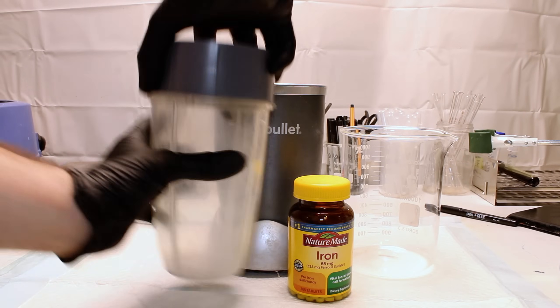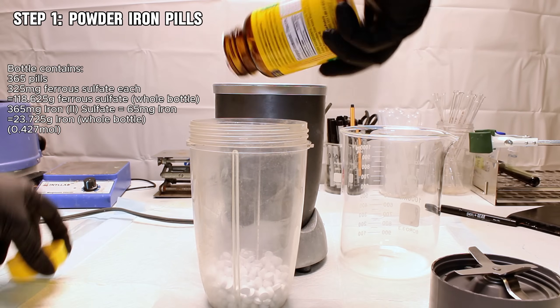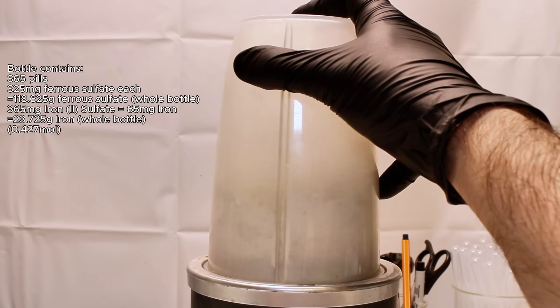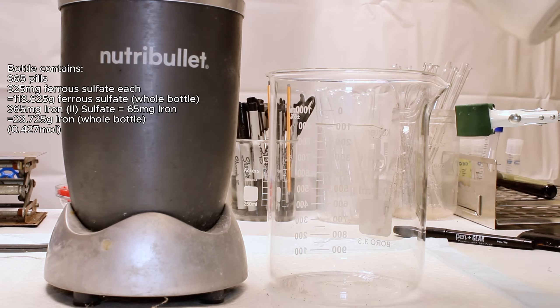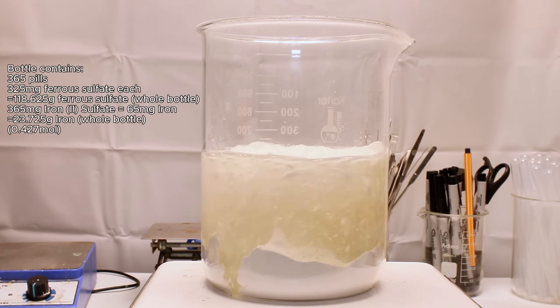To get started I went ahead and powdered the pills in a blender. This bottle contains 365 pills that allegedly contain 325 milligrams of ferrous sulfate, equating to 65 milligrams of pure iron. This is 118.625 grams of ferrous sulfate, or 23.725 grams of pure iron total, or 0.427 moles.